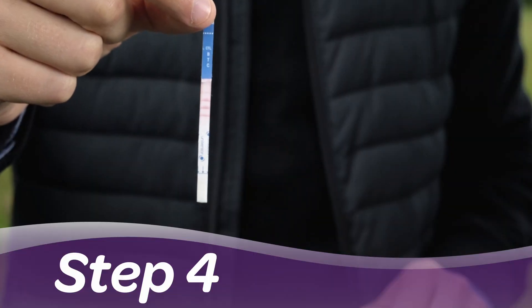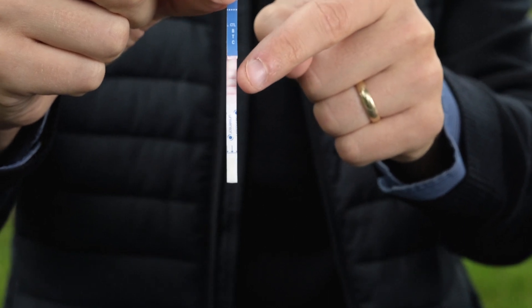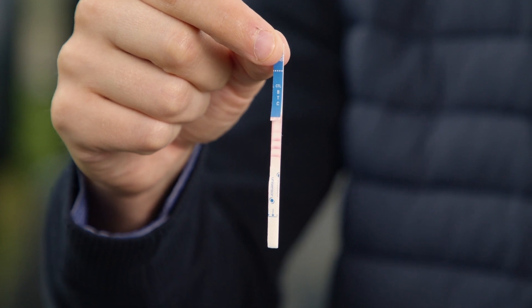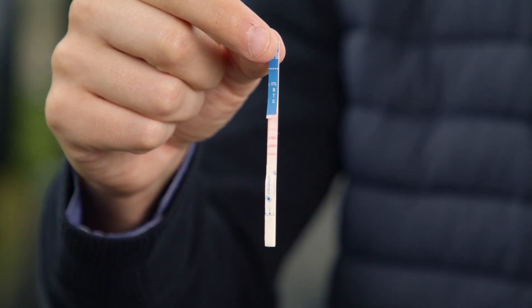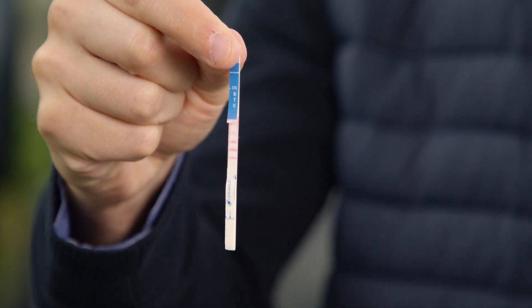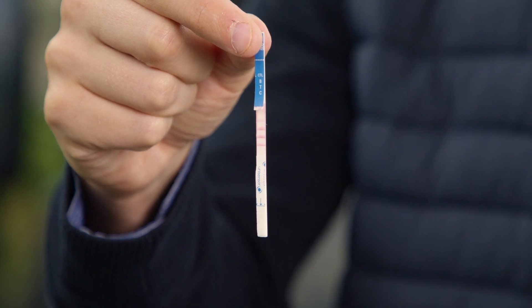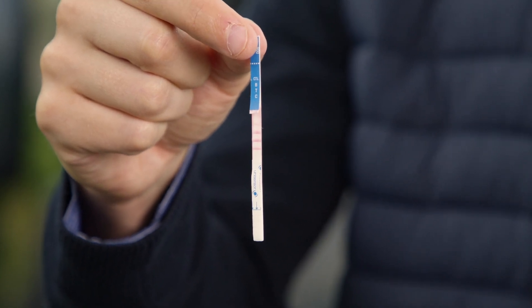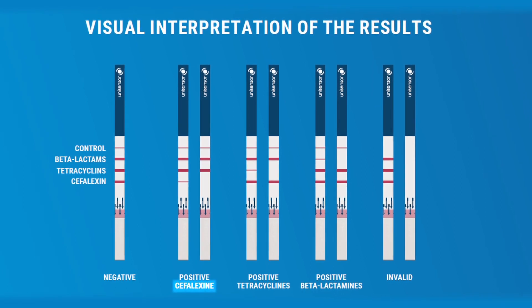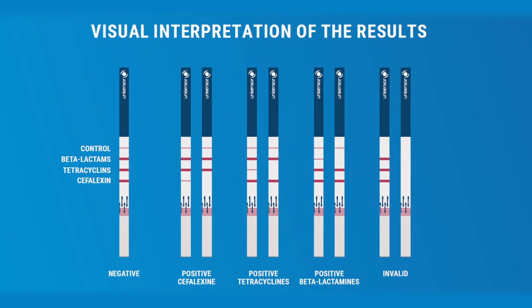Step four: we read the result. There are four lines we need to pay attention to when reading the test. The three deeper red lines with a faded line at the top indicate a negative result. Our test strip has three deep red lines and a faded one, so that indicates that we have a negative result. Let's compare our test strip to the interpretation guide at the back of the pack. If you have a positive for cephalexin, tetracyclines or beta-lactams, you'll need to do further investigation.